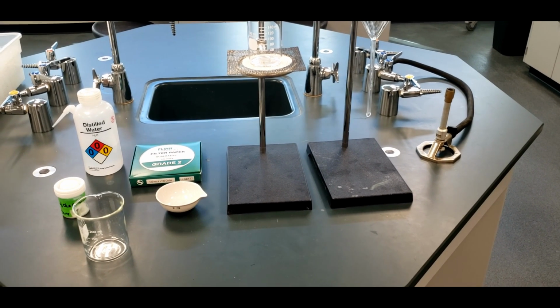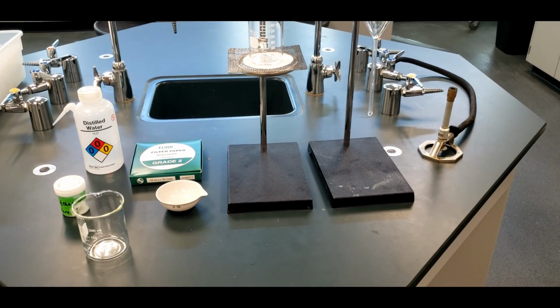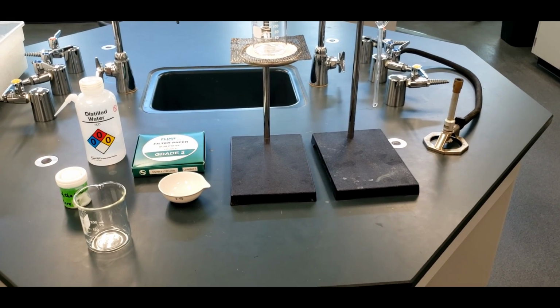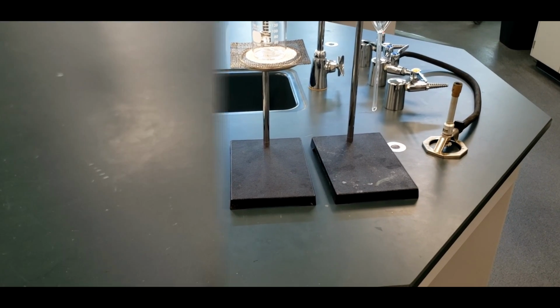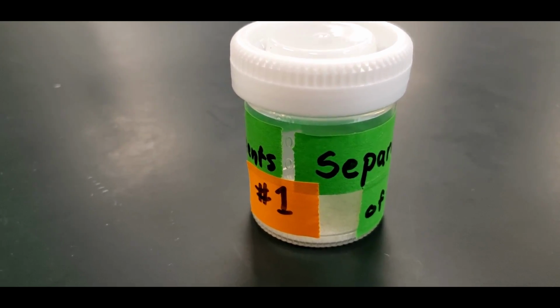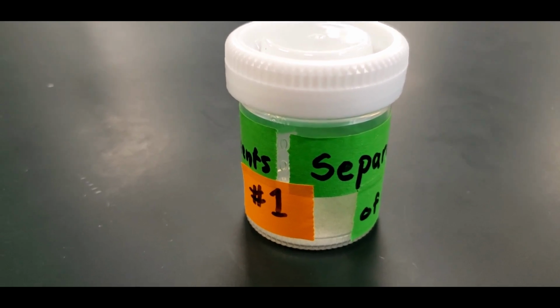This is the separation of the components of a mixture lab. Here are the different pieces of lab equipment, and over on the left there in that little green bottle is the unknown. So we are set, so let's get started. Here is the unknown for the lab. It's unknown number 1. It contains unknown amounts of ammonium chloride, sodium chloride, and sand.